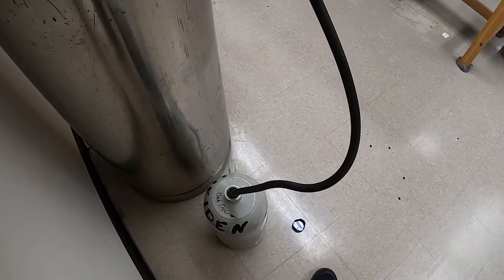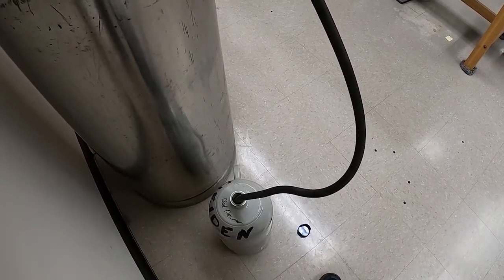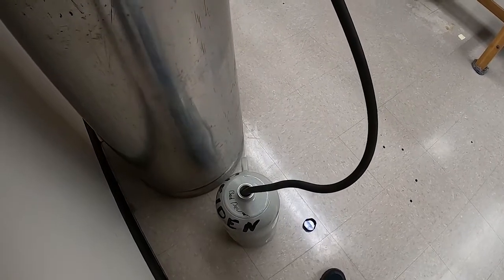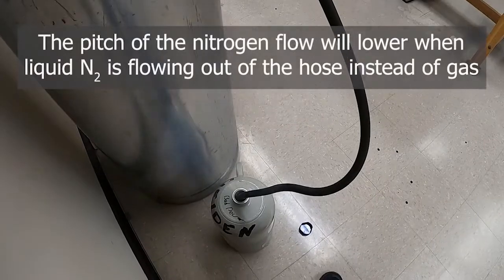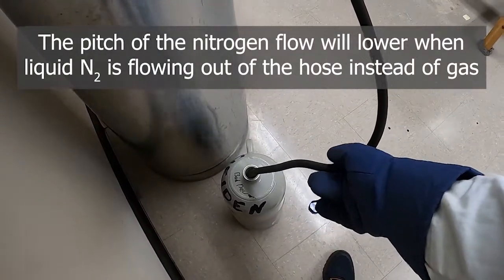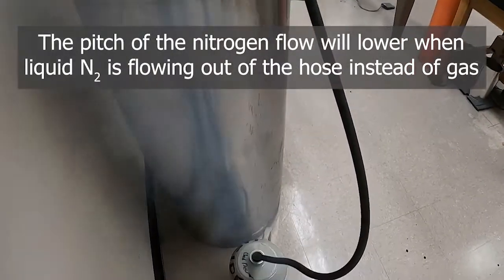flow. So at first we're just going to be cooling down the inside of the dewar, since it's basically room temperature. The liquid nitrogen is quite a bit colder than that. It's got to cool down that interior of that dewar before it can condense and stay liquid in there. So we should be getting pretty close. That vapor's kind of chilly on my arm.